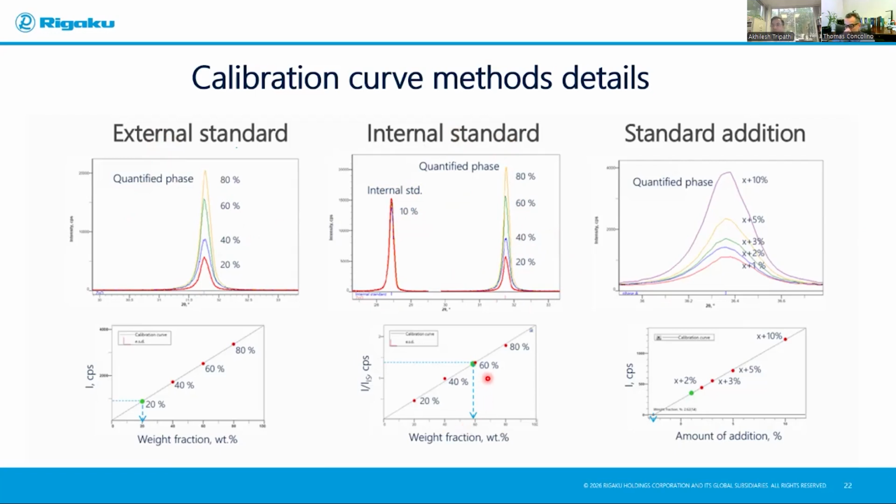For example, I mentioned dust analysis or respirable silica. Respirable silica is usually sprayed on a silver membrane, and the silver membrane amount is fixed, let's say 10%. So if the measurement shows 11.2%, you know that 1.2% is the error that can happen in your sample too. So that's how an internal standard helps you to further correct your calibration curve study.